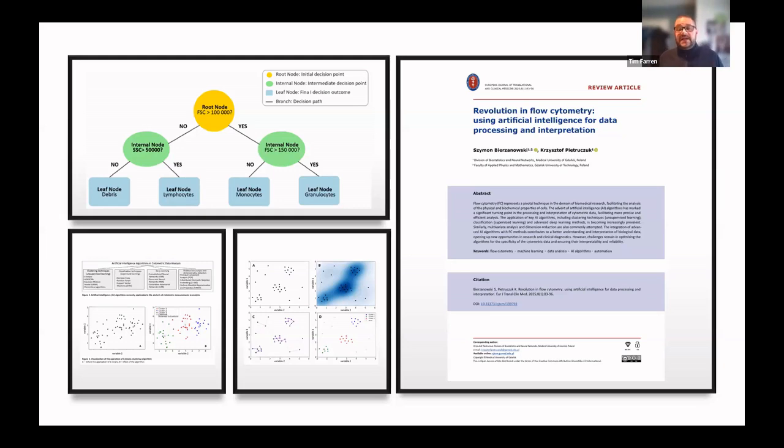We know that there are supervised models out there now that can be trained on your own known disease patterns within your service. And they can be used to help support recognition of similar profiles in new samples, again improving reproducibility. And now I'm certainly no expert in AI, but deep learning methods are there that can process complex marker combinations, and this could assist in identifying subtle immunophenotypic changes, particularly on therapy. And there are obviously better visualization tools, such as tSNE and UMAP, that can reduce these large data sets into much more simplified 2D maps, making abnormal populations much easier to see at a glance.